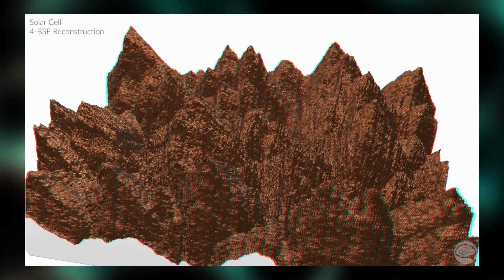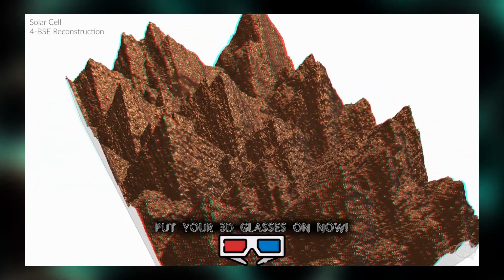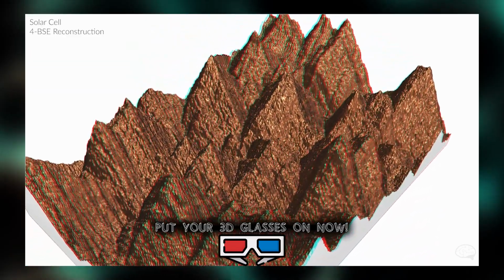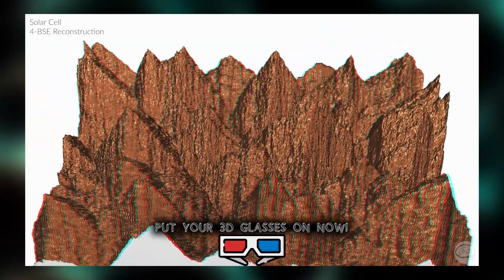So why use 3D reconstructions? What are some of the reasons someone might want to make a 3D reconstruction of their sample? Well, you can do all sorts of analysis on the surface of your sample once it's been reconstructed like this. Anything from Z height measurements to surface roughness to porosity to volume measurements. There are a lot of practical things you can do with this data.